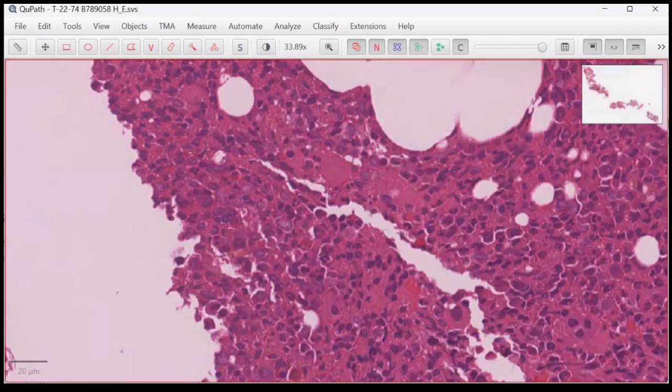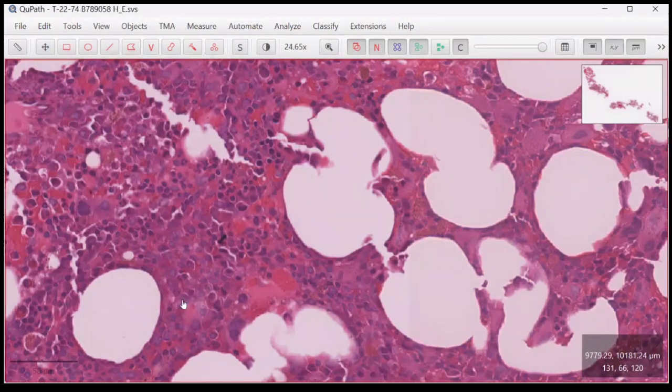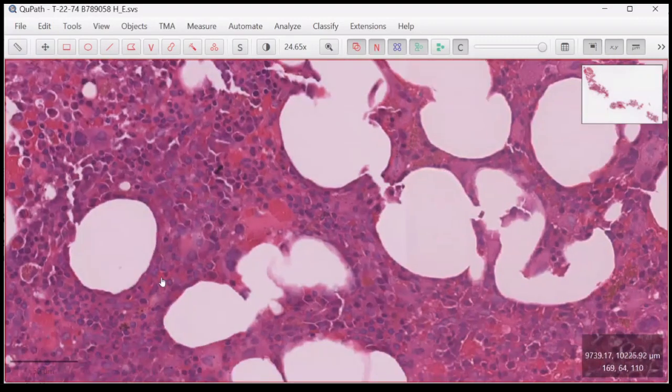Because of neutrophil maturation, we are suspecting that there is some marrow improvement, marrow regeneration, and improvement to the treatment. But we need to be careful on these particular immature cells, whether they are still expressing 34 and 117 to indicate they are not in complete remission.